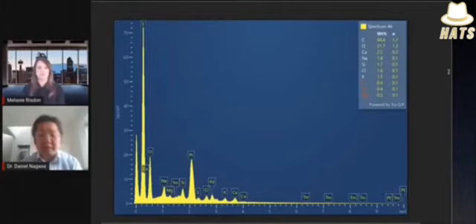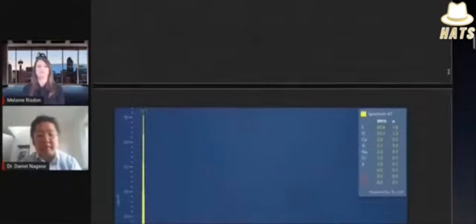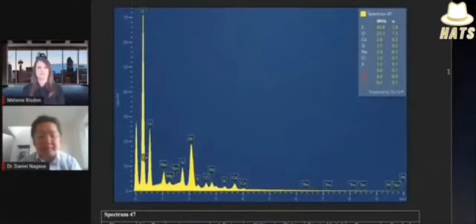Okay, so let's scroll down to spectrum 47, which was on another part of the fiber seen in the Pfizer sample. Again, same thing: carbon, oxygen, a bit of calcium, some sodium chloride, so there's some salt on that part of the fiber. But again, thulium and silicon are showing up for some reason. So there's thulium in the Pfizer sample that we didn't see in the Moderna sample.